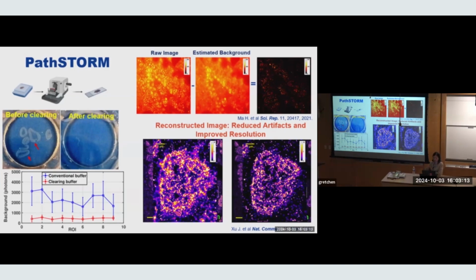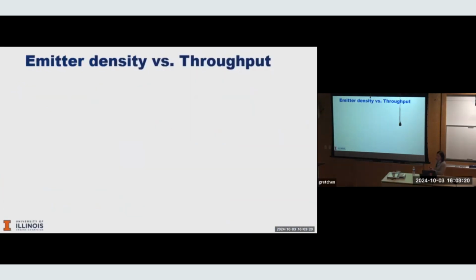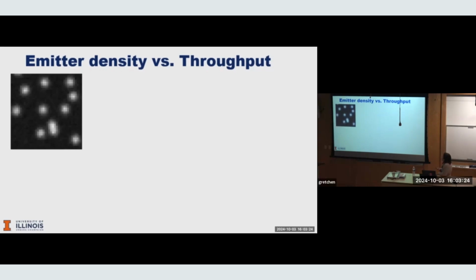So this is one aspect in terms of improving the robustness, but there's also throughput issue I talk about. So this approach, single molecule localization, inherently you need the sparsity of those individual molecules that's spatially sparse, and then we localize the center. So overlapping molecule is something bad because you basically lower your resolution.